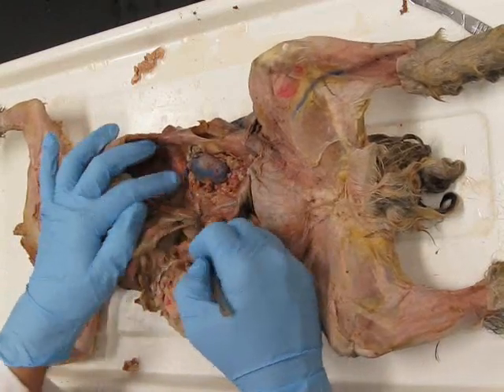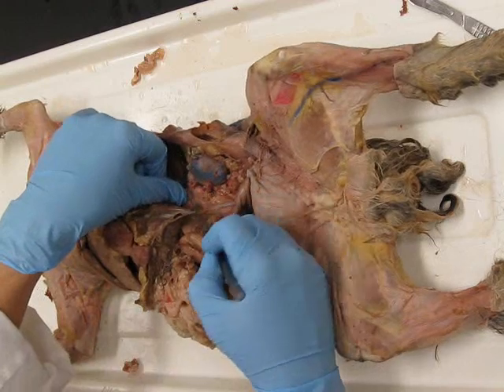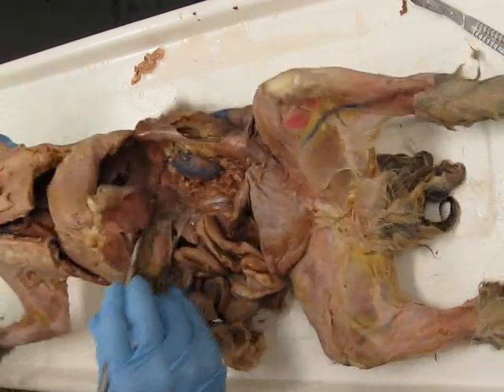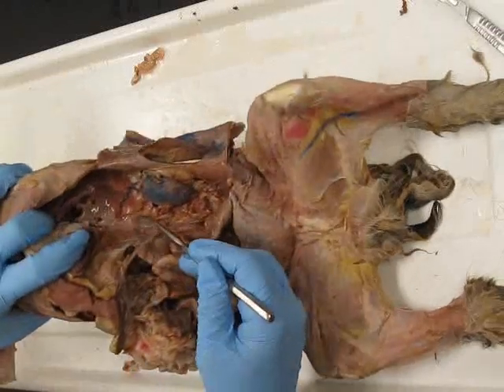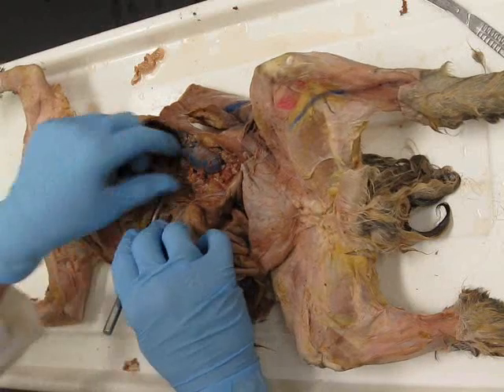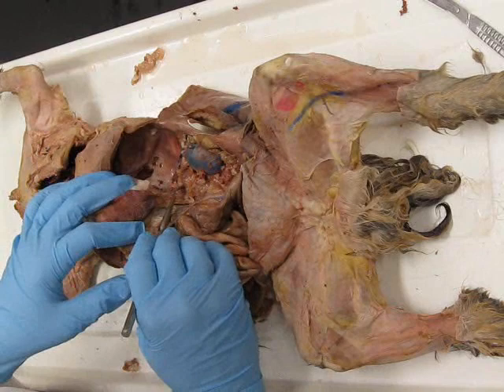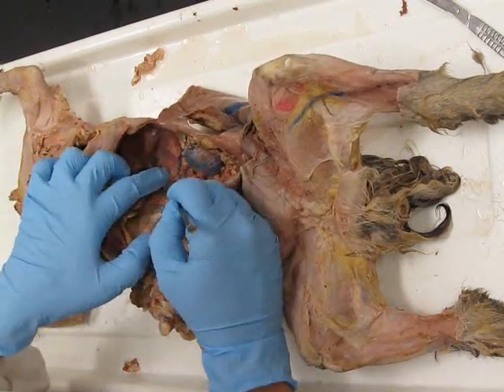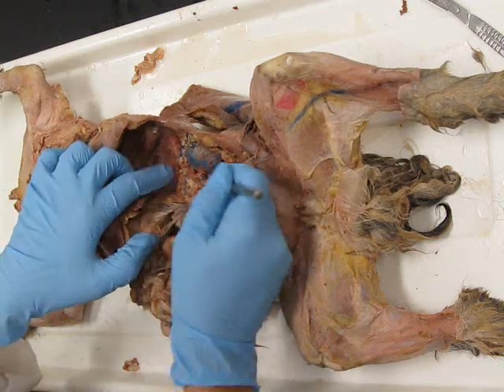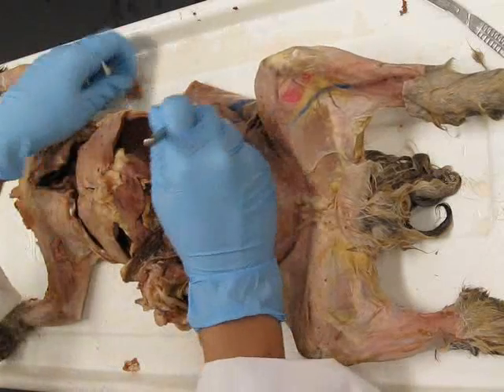Okay, and then above and medial to that will be the adrenal gland. You can palpate where it is. It'll feel like a pinto bean. And there will always be a vein right over it, right there. And just keep removing that membrane from over the adrenal gland as well. This is the one that we skipped the other day because it was behind this membrane. Okay, so I'm just clearing out a little bit more fat.